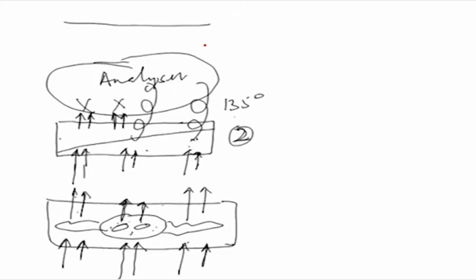All right, let us return to our discussion. Let us go through and understand this, like I have shown you on the screen, how a plane polarized light is separated. So, let us go through the path of the light in this particular technique. Now, what is happening? First, polarized light is generated at 45 degrees. This polarized light is generated by a polarizer.